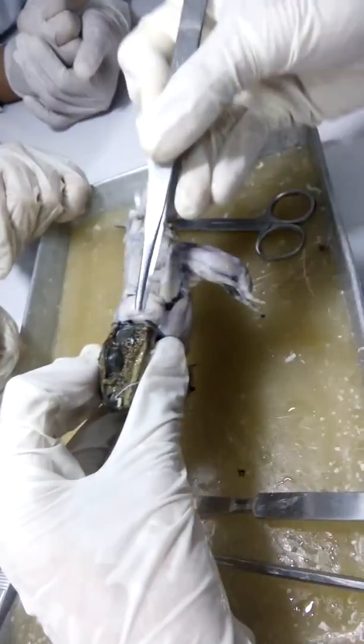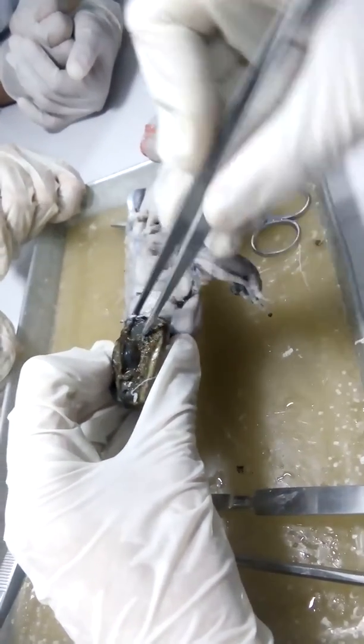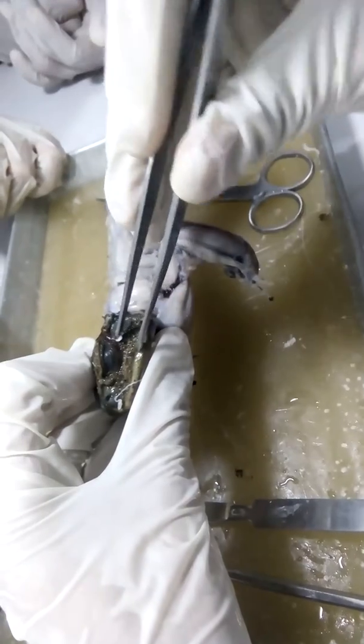If you skin that off, makita nimo siya dire. So just below the eye and just before the tympanic ring. So temporal na siya dire. And then underneath your temporal nga muscle would be your masseter.